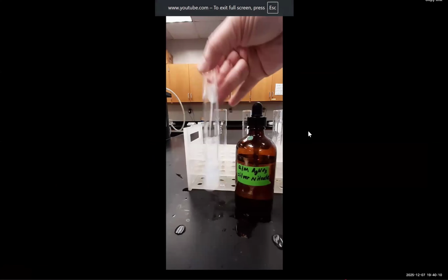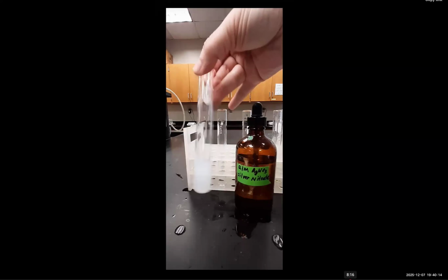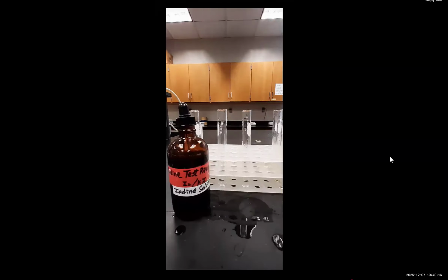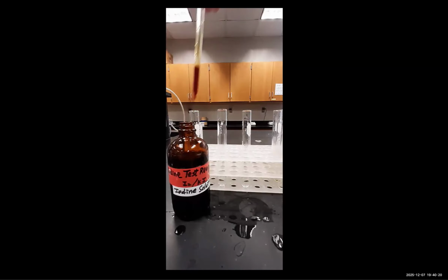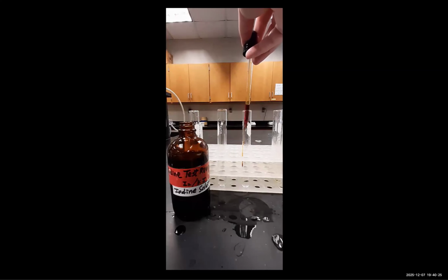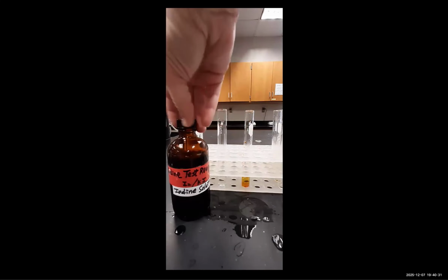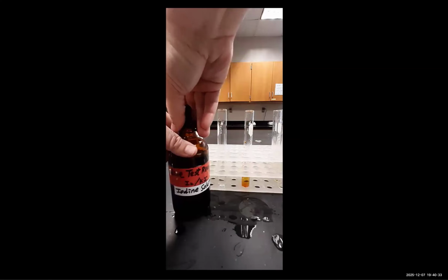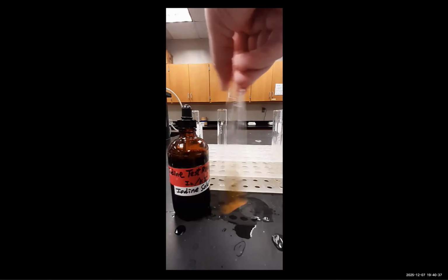Let's take a look at the starch solution now. When we tested for starch using the iodine test reagent, as we can see, when we add the iodine test reagent, we do not observe that characteristic dark blue color, telling us that the water inside the beaker after 30 minutes of dialysis is negative for starch.